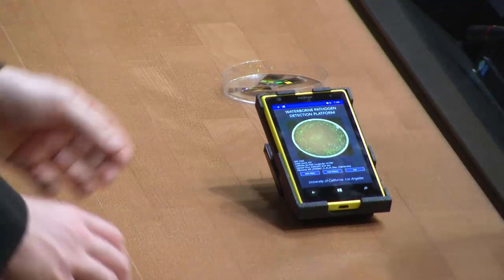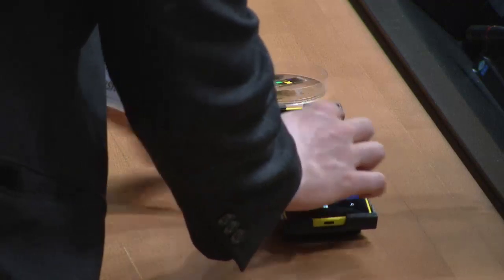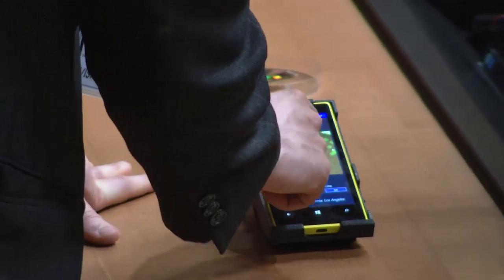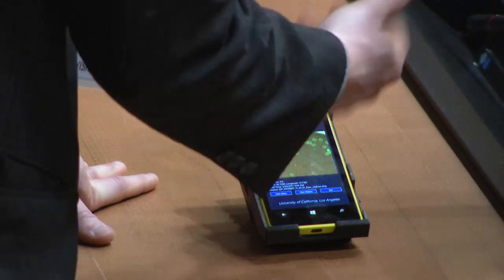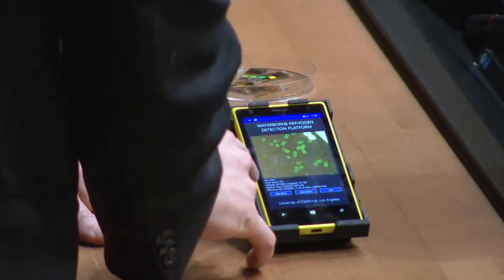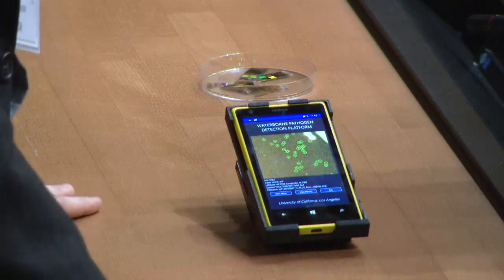Here is the result. The computer has gone through and actually circled the Giardia cysts. And you see how it's differentiated? It says this one's not, it's going to be dust or something. And then it gives you a cyst count, a time, a date, all that stuff.